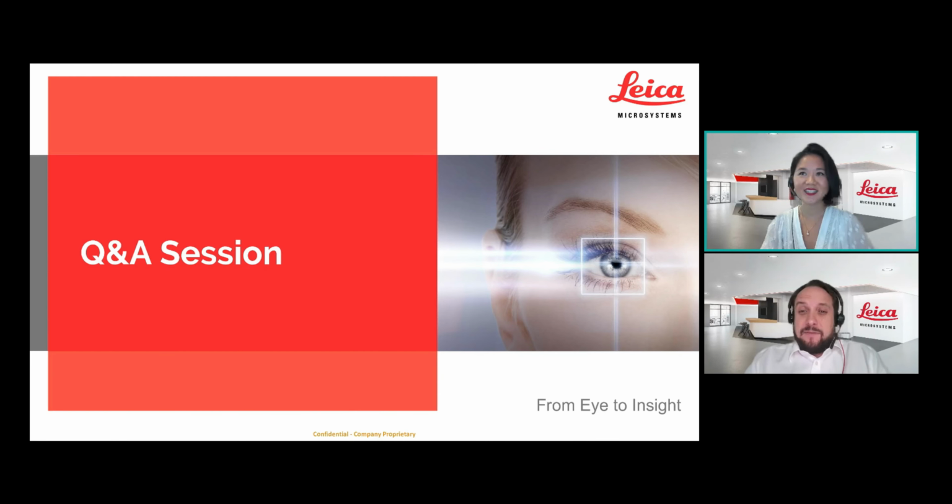This isn't something generally that light source manufacturers specify. So typically modern LED light sources for fluorescence last a very long time. So I would expect you could get a typical lifetime of a few years out of this. But this is not something that I have the numbers for. Hope that answered the question.